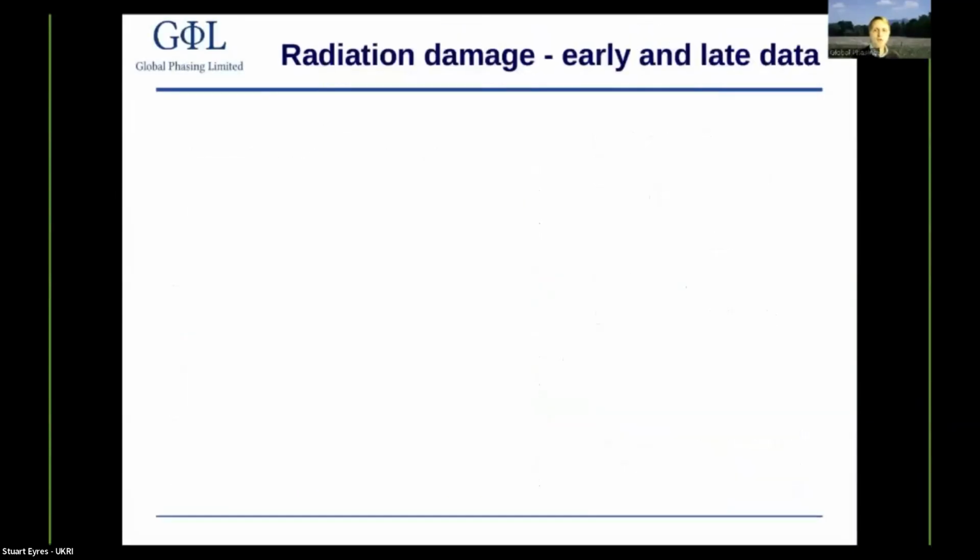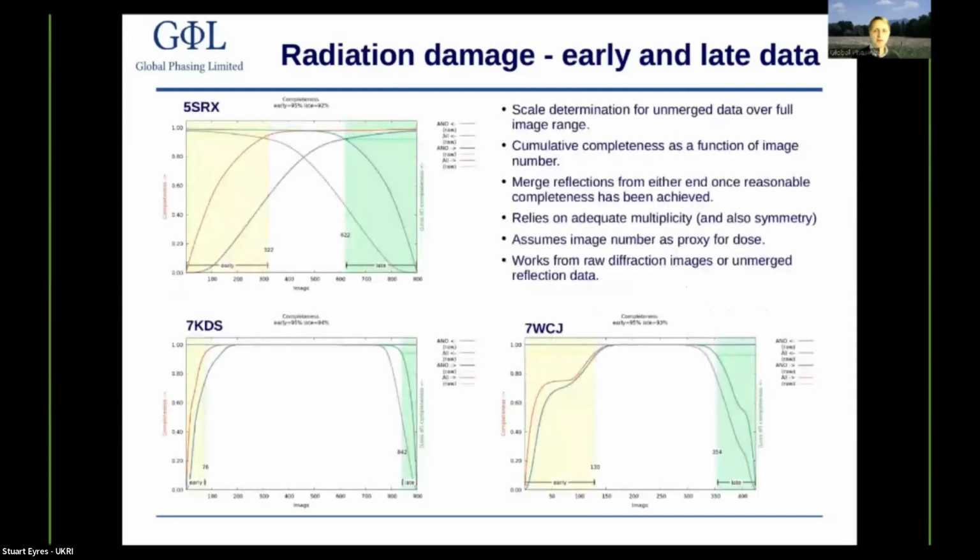The last example to show the added value of unmerged data being available as a point of modeling and refinement has to do with radiation damage and its visualization. You have heard already yesterday by Catherine Shelley about radiation damage, and the work by Kay Diederichs regarding zero-dose extrapolation comes to mind as well. Here we want to show you some simple tools for visualizing potential radiation damage at the map level and how it could help finding the best model parameterization during refinement.